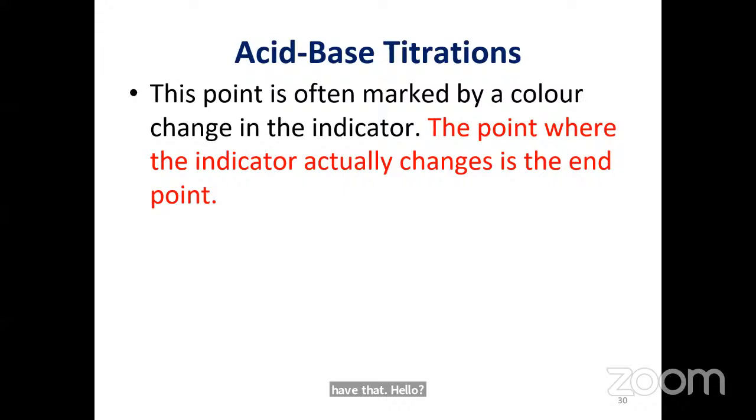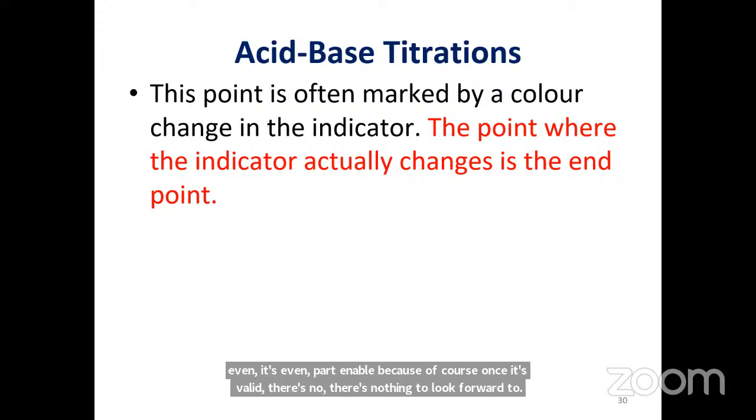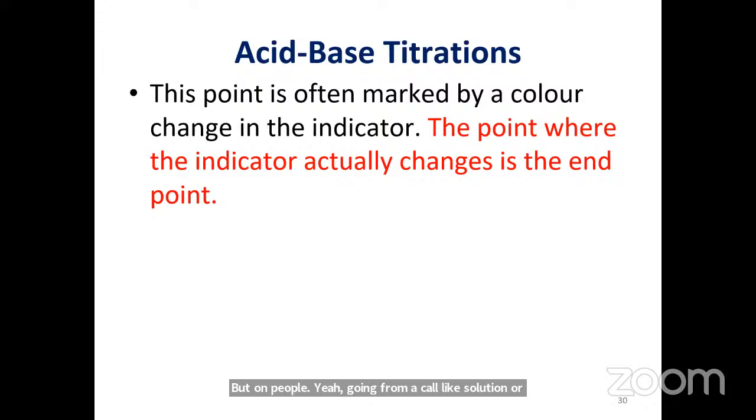But students are not so careful. Some of you like color so much. In fact, when you're going from pink to colorless, it's even pardonable, because of course, once it's colorless, there's nothing to look forward to. For some people, if you are going from a colorless solution, or maybe from methyl orange, the yellow to pink, they will want to see that beautiful pink before they stop the reaction.